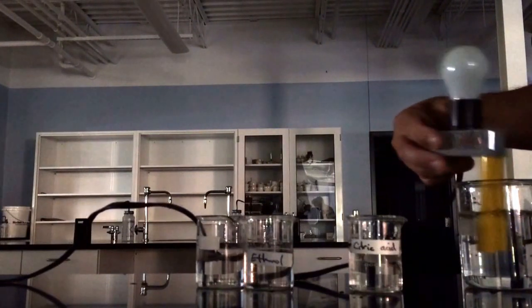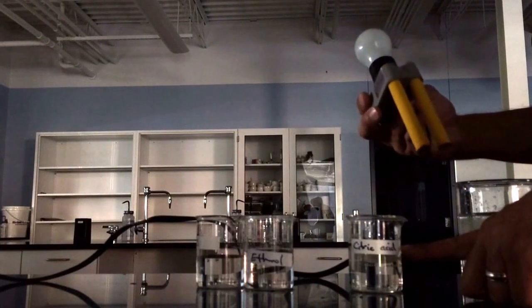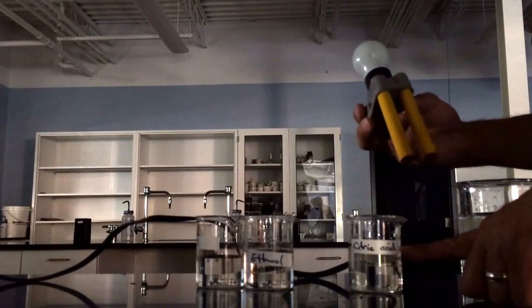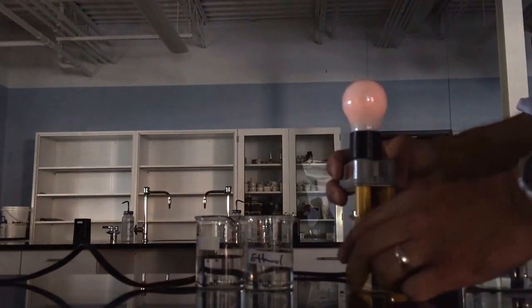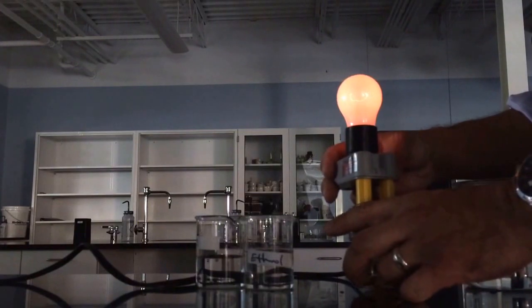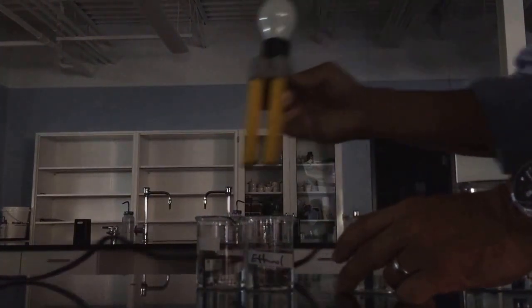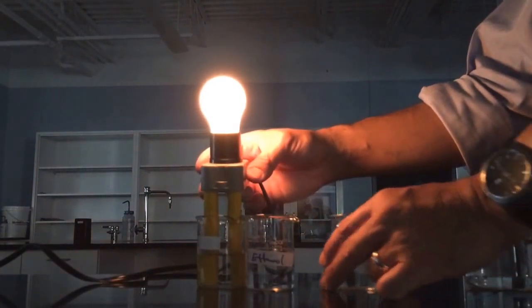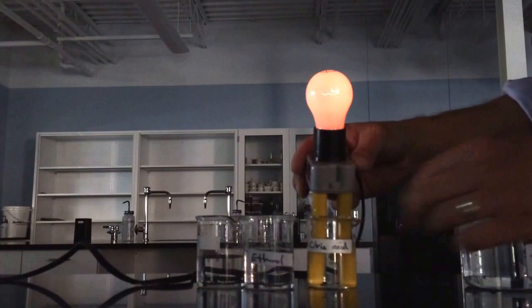Citric acid, this is the compound that makes your Skittles sour and most other candies, as well as, of course, citrus fruits. If we test the conductivity of this compound, we get the barest, just the dimmest little glow, right? So that's much dimmer than what we saw in the sodium chloride. That's a nice bright glow. When we switch this to the citric acid, we get this dim glow.